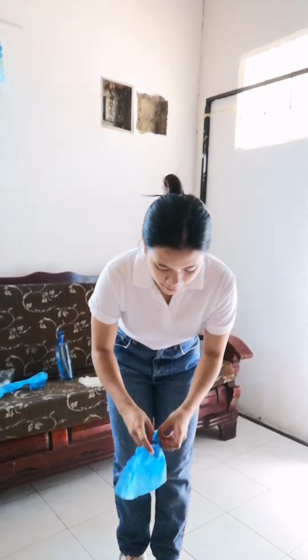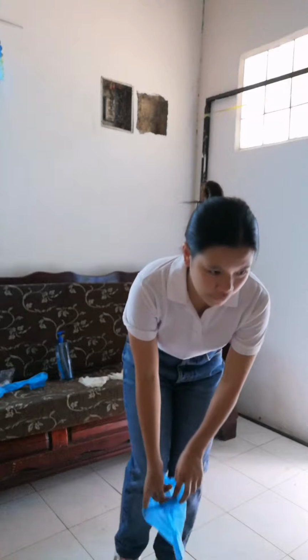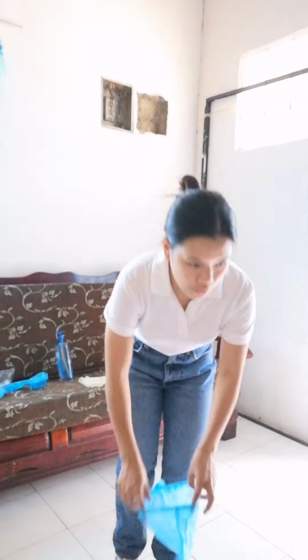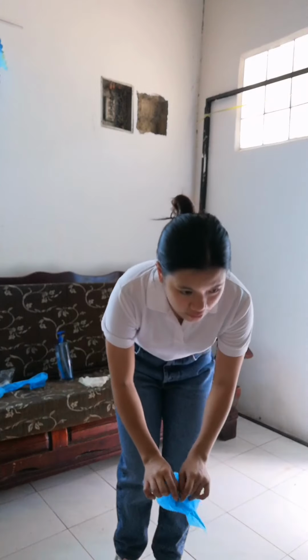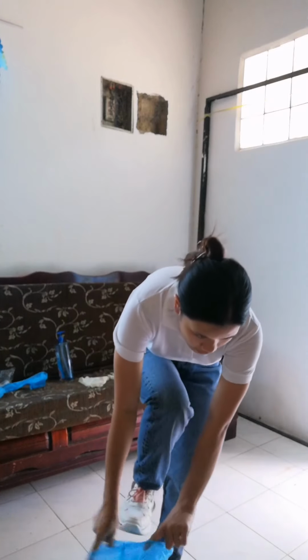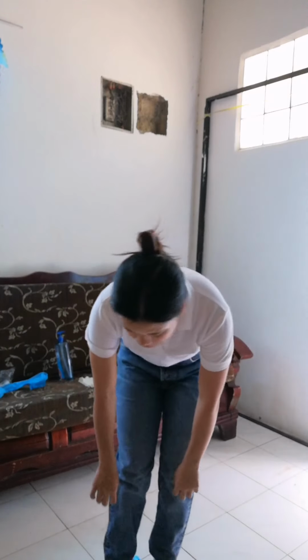Second is to don our shoe cover. Upon donning our shoe covers, we need to make sure that all of the areas of the foot are covered and that the shoe covers are snug over our ankles and cuff. This is to completely block the microorganisms from entering.